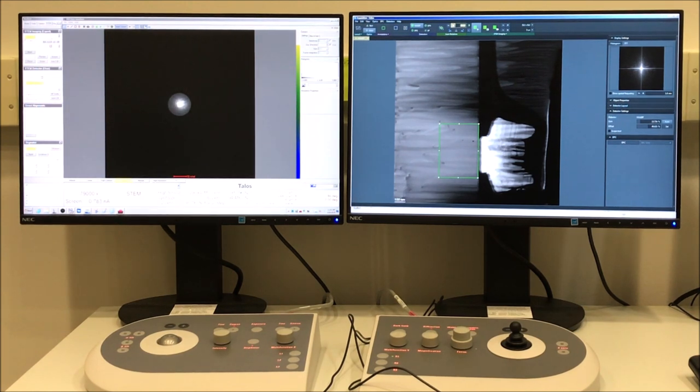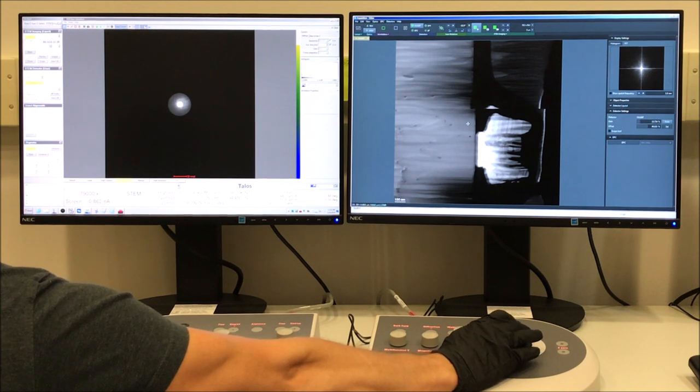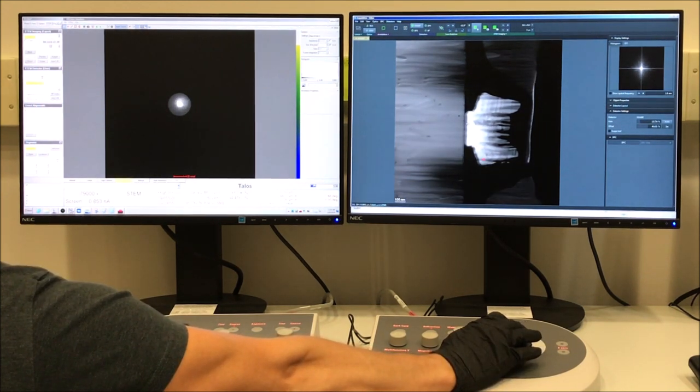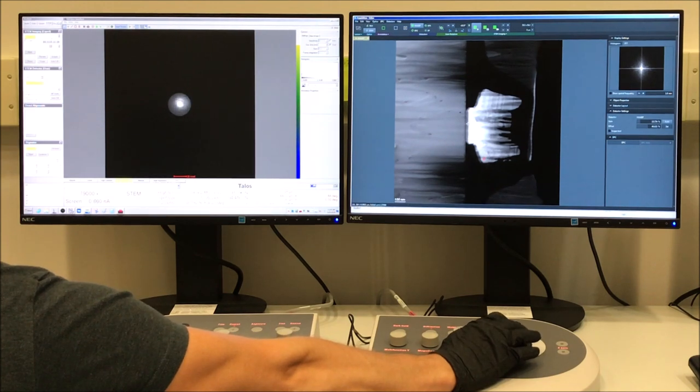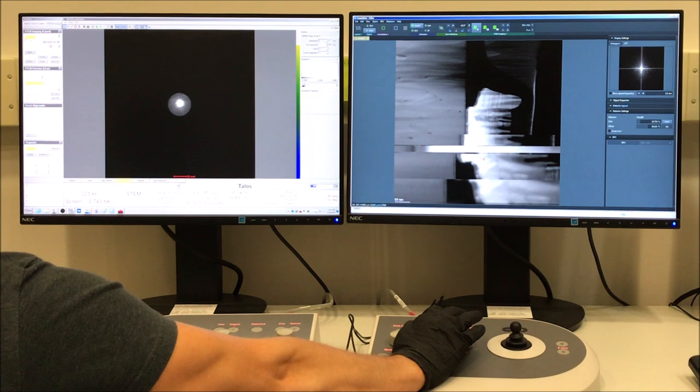And once this is dialed in, you can just select the annotation tool and then delete. Then move your area of interest to the middle of the image. And then you can mag in and focus in your area of interest. So you can see it's a little bit blurry. And there we go. Basically perfect now.